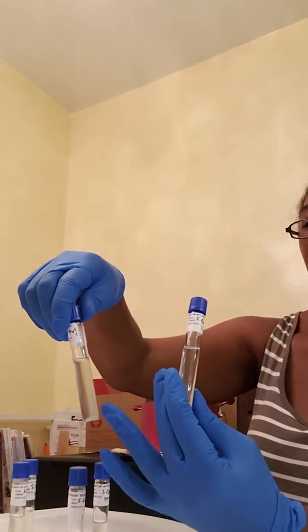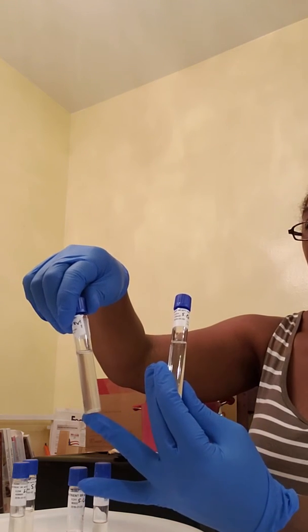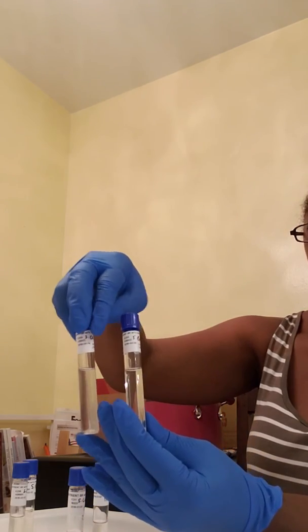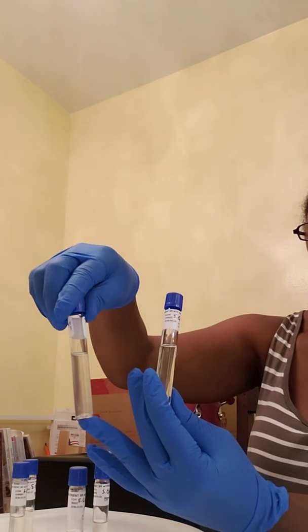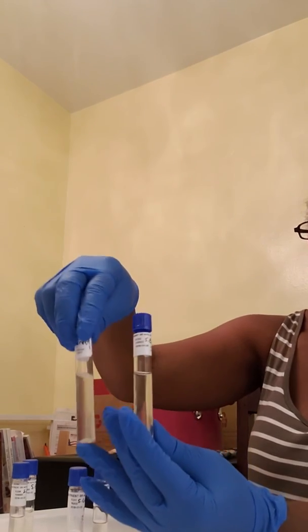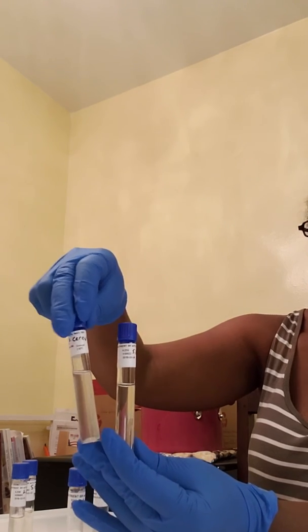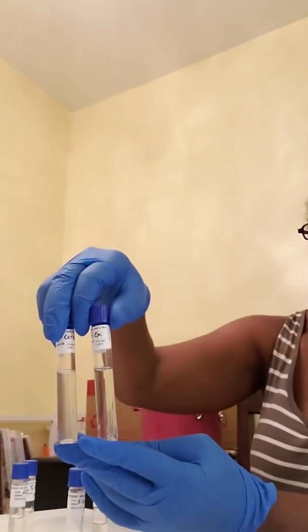I noticed that there were little bubbles along the side, like there was growth attaching to the tubes, which I found pretty interesting. And you can see that there. Not sure how well that reflects through the camera, but these two are 7%. This is cerevisiae. This is epidermidis.